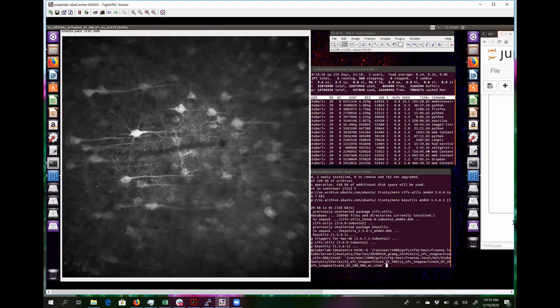Yes, so I'll say about 1 in 5 mice, let's say 20% of mice, have a weird thing where they do show shifts across days in the blood vessels, and sometimes the cells appear as if they're moving too. But weirdly enough, I actually find that many of the same cells are in the exact same location. So I see. My feeling with those ones is that it's probably just because the lens moves a tiny bit in some mice.